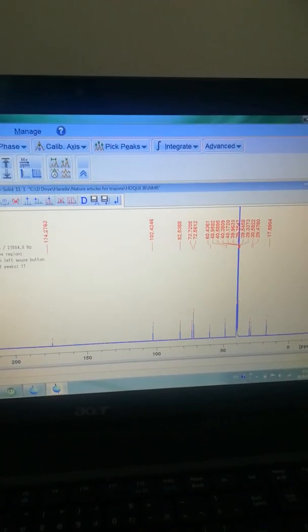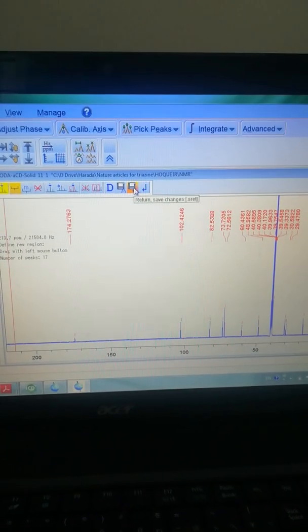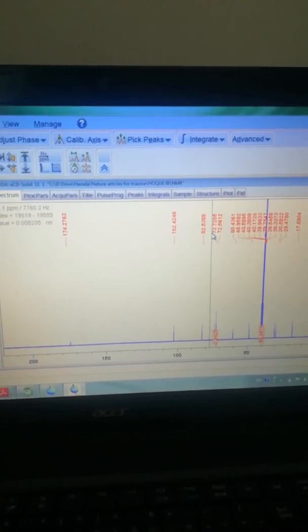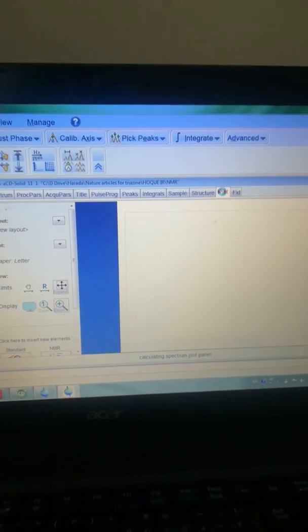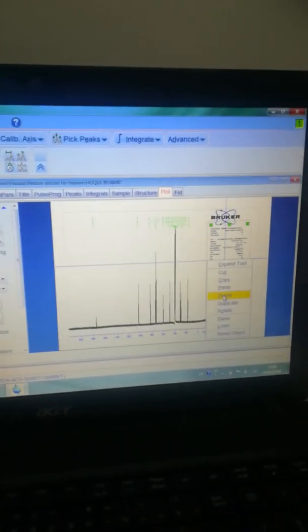You can save using Return and Save. Now save and return to the original spectrum. I would like to plot it, so click the plot option here. Now it's ready for processing.